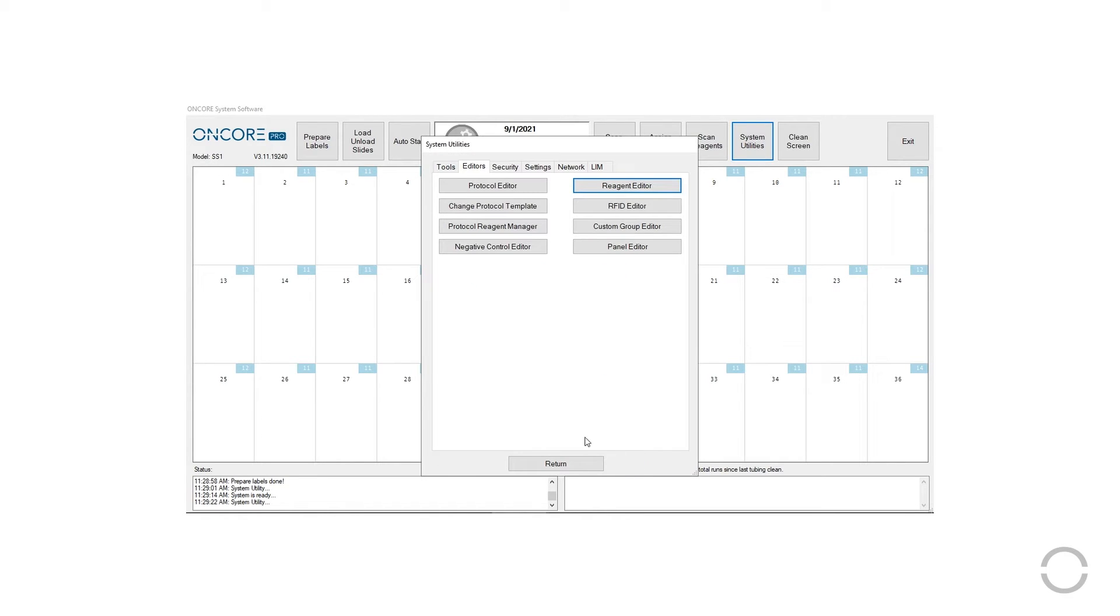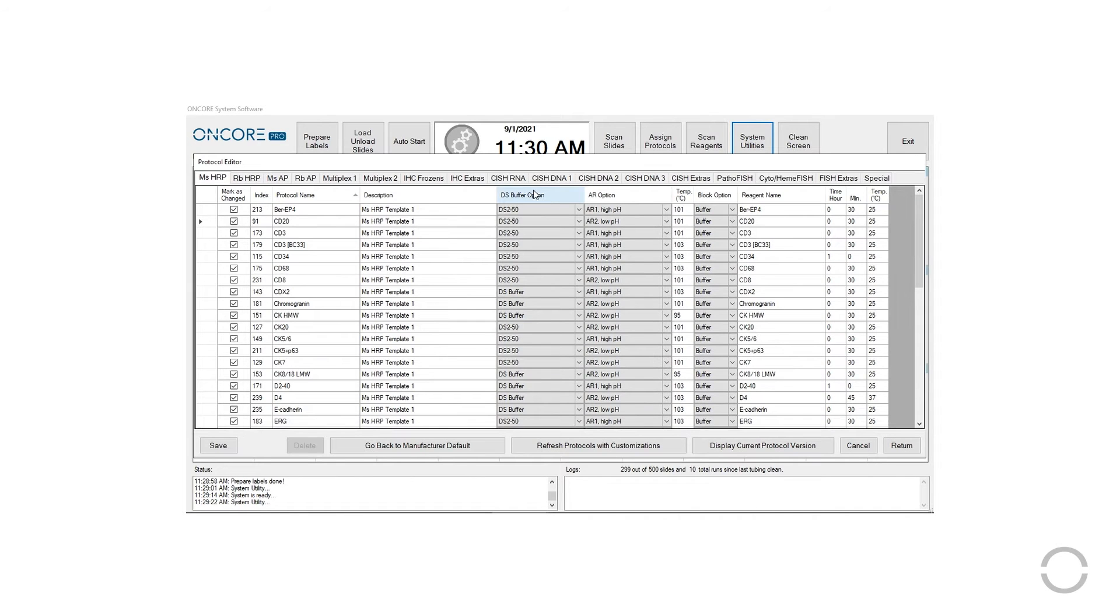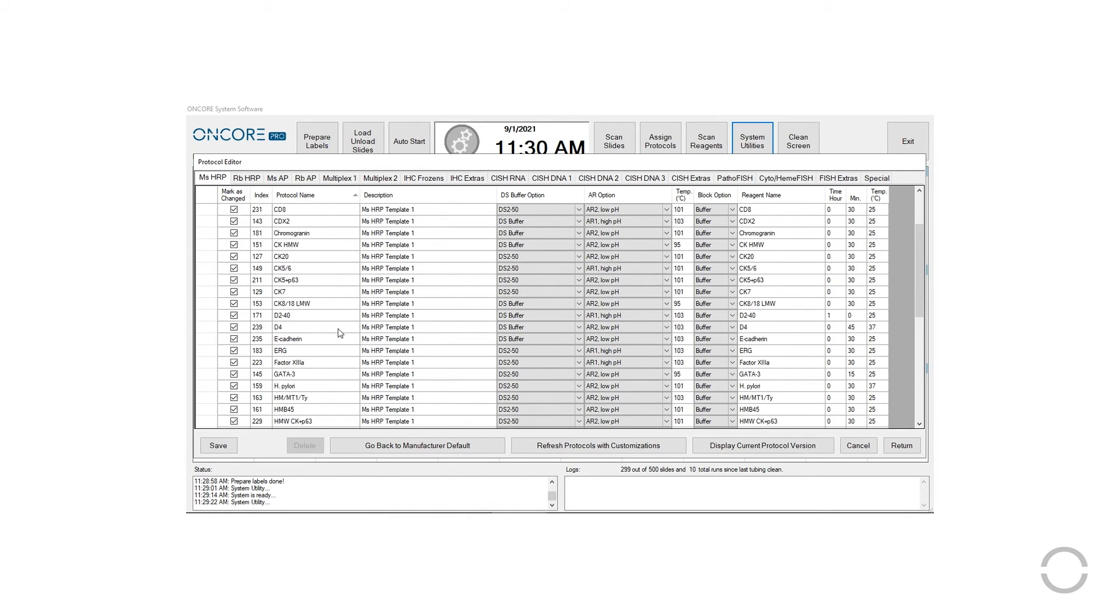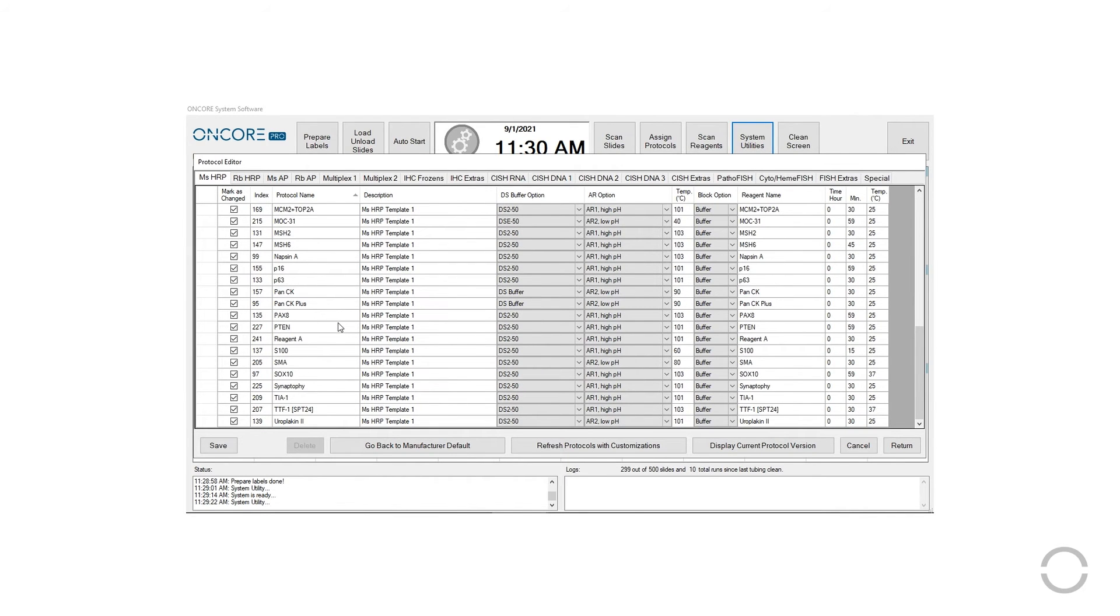Protocols will appear under the tab of the reagent's corresponding protocol template. The user may customize the DS buffer option, the AR option and AR temperature, the block option, primary incubation time, and the incubation temperature.